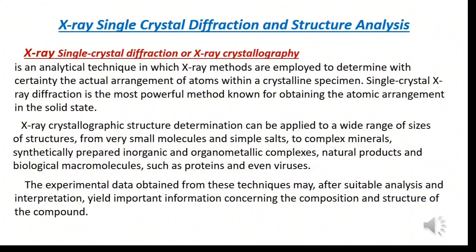X-ray crystallographic structure determination can be applied to a wide range of sizes of structures, from very small molecules and simple salts to complex minerals, synthetically prepared inorganic and organometallic complexes, natural products, and biological macromolecules such as proteins and even viruses. The experimental data obtained from these techniques may, after suitable analysis and interpretation, yield important information concerning the composition and structure of the compound.